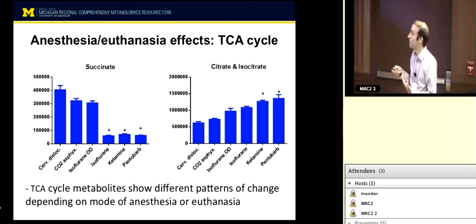And so it depends on what you're looking for. If you're looking to study glycolytic metabolites in their native state, we feel like you get a much closer picture here under anesthesia than you do post euthanasia.